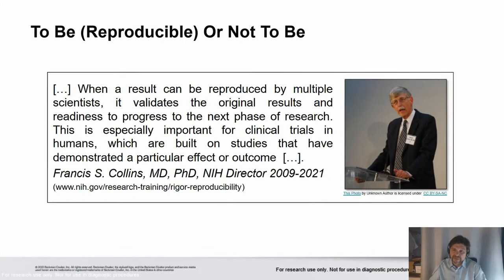So let's get into the ONE Study first. I would like to pick up a statement here in the beginning from Francis S. Collins, who was directing the NIH from 2009 to 2021, and who really puts an emphasis on the importance of reproducibility. When a result can be reproduced by multiple scientists, it validates the original results and the readiness to progress to the next phase of research, to ask the next question.